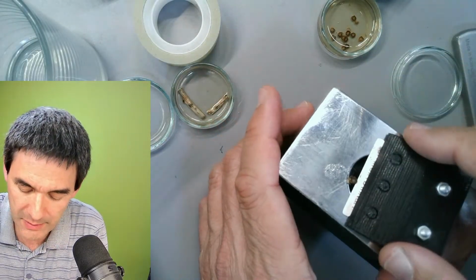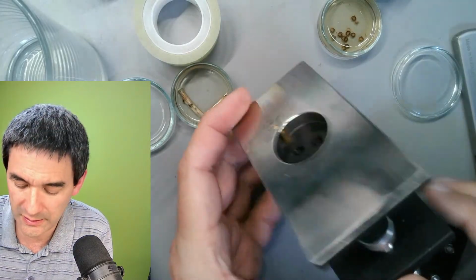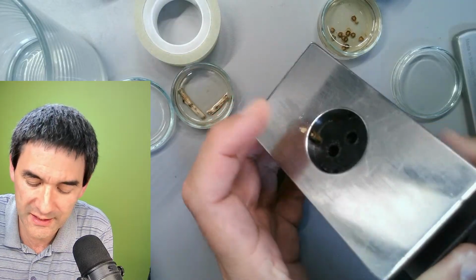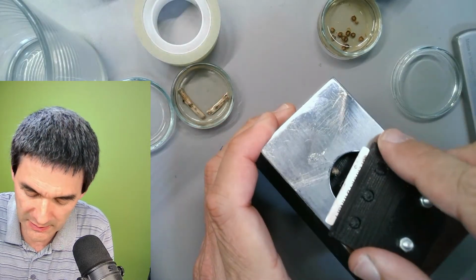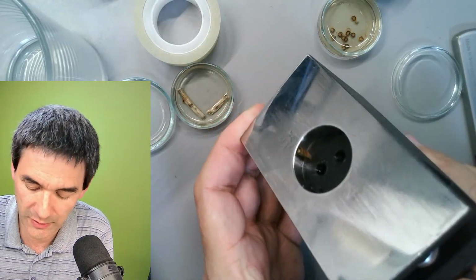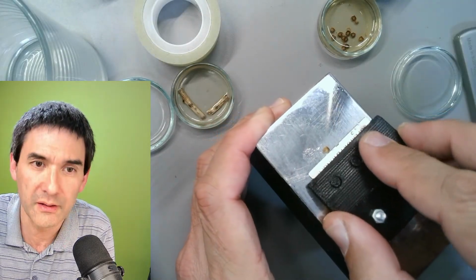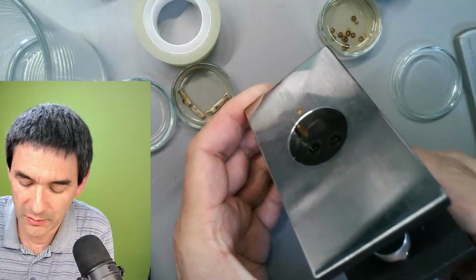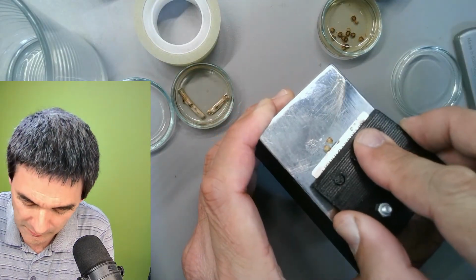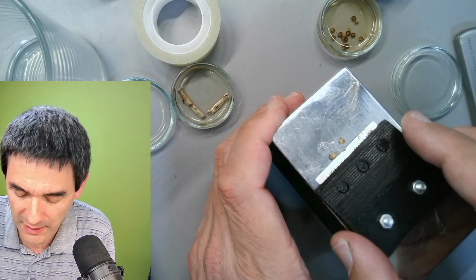And then basically what I've done is I've been cutting it, and then I've been advancing it 1, 2, 3, 4, 5, 6 times. Yep, have you seen? 1, 2, 3, 4, 5, 6. Okay, so you see that it does kind of work.